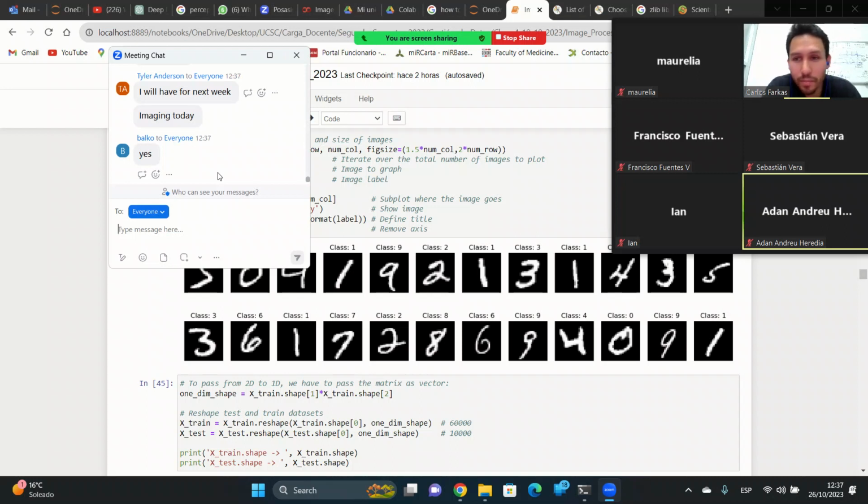So maybe we can quantify intensity or something like that, or distinguish shapes, or localization. Yes. Okay. Can you please send me an email with a set stack or something you have, and I will prepare something very briefly on how to load your image on Python. And then, once you have your image loaded on Python, you can apply all these things, okay? With the aid of ChatGPT or Perplexity or Stack Overflow itself, or scikit-learn documentation if you want to go straight with the documentation, which is the best course of action, okay?